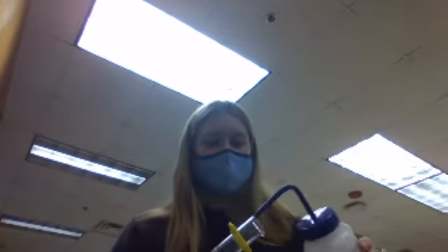So now I'm gonna wash this out with this. Do I just go like that? Yeah, tilt it and shoot it up like this. Make sure that you're over it though. It's not shooting out. I need more.